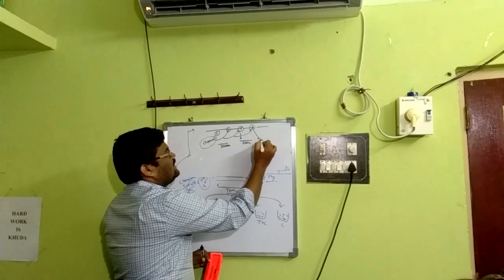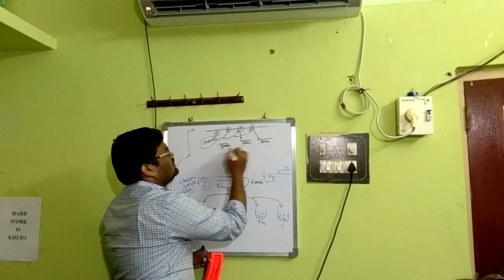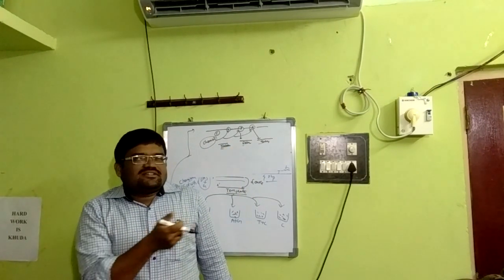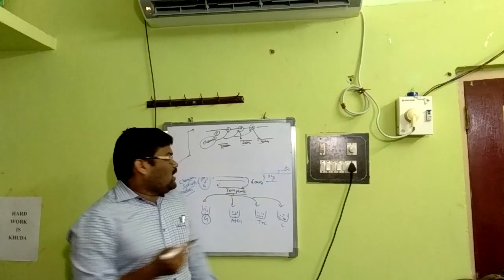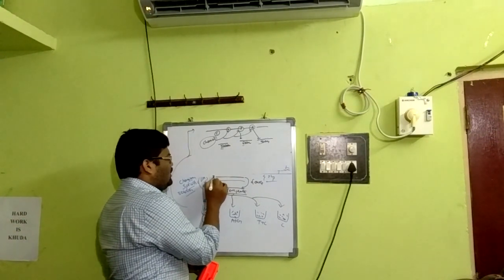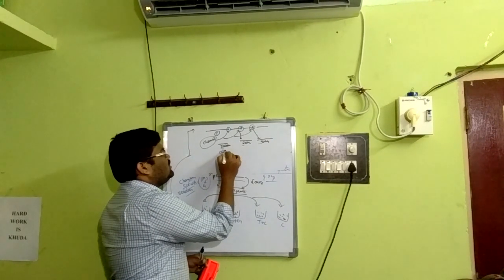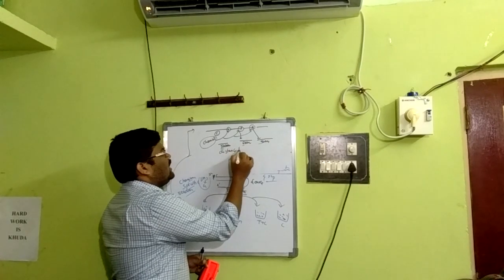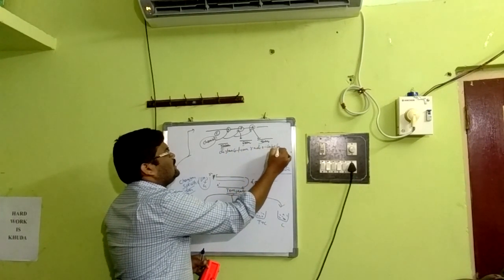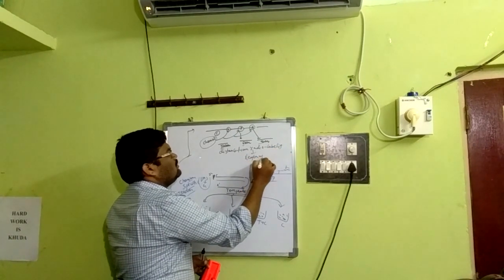Here, 9 bases. What is 3, 6, 9? And how can we determine the length of the fragment? It depends on its distance from the radio labeling. I told you already, that means the P32 at the 5' end, its distance from the radio labeling determines the length of fragments.